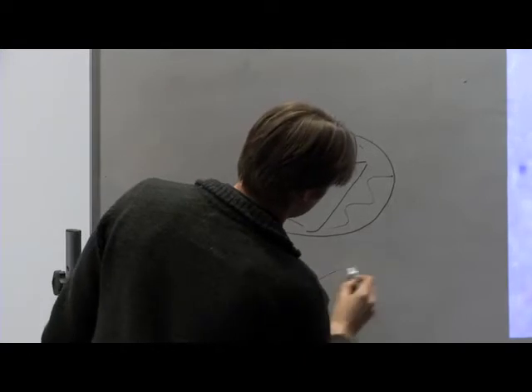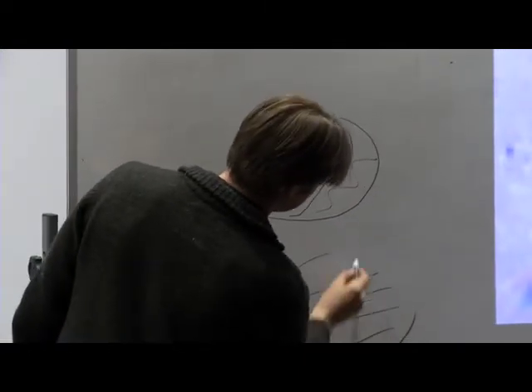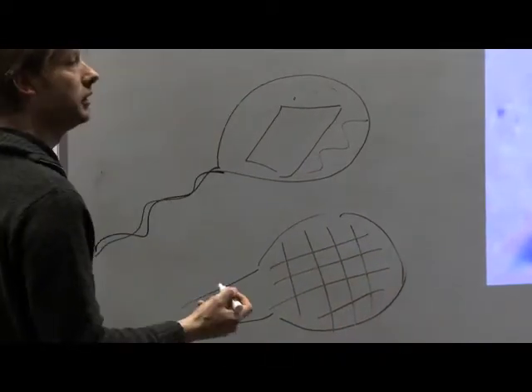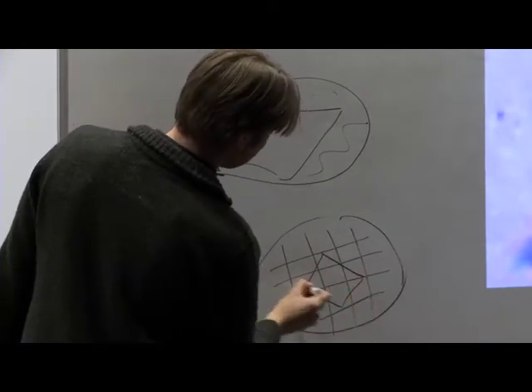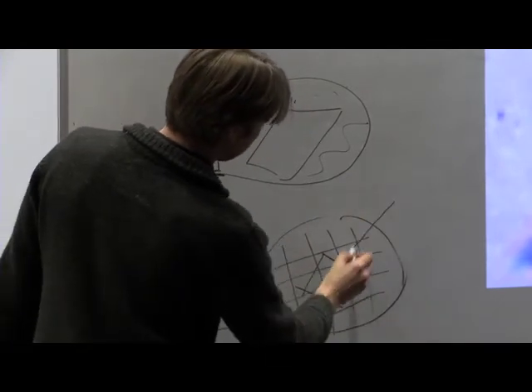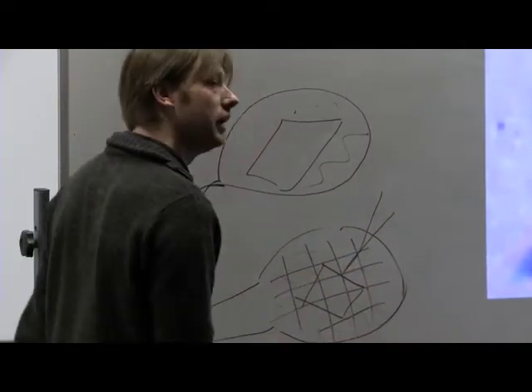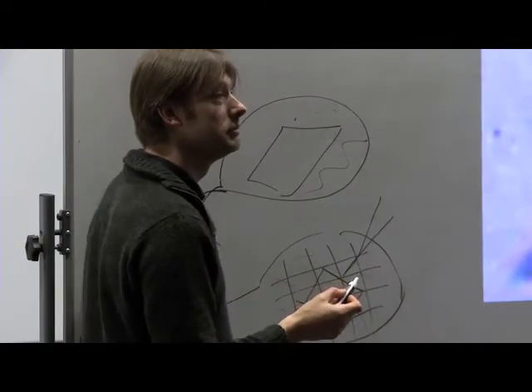Nowadays you can get really cool loops that are made like a tennis racket, of a material that diffracts X-rays very poorly, so they don't leave any background. Now you can put your crystal on there, and then take a small paper tip and try to remove all the liquid around it. And then you can freeze it, like your Vitrobot.